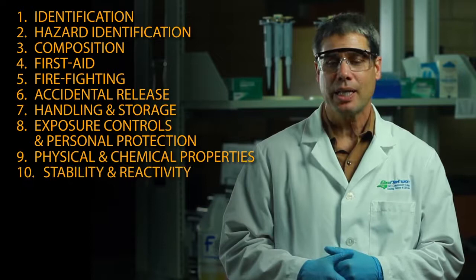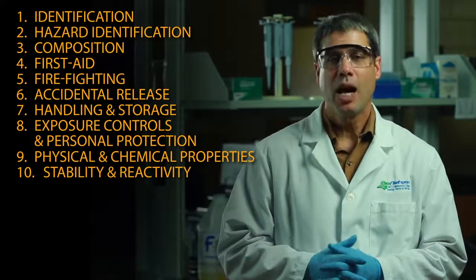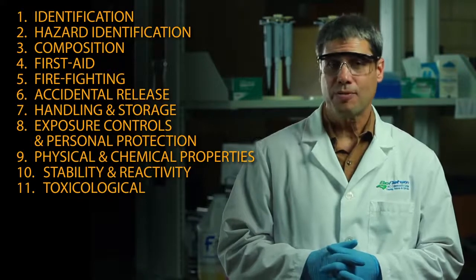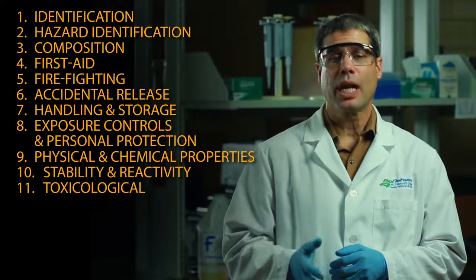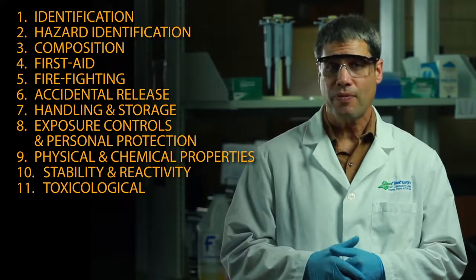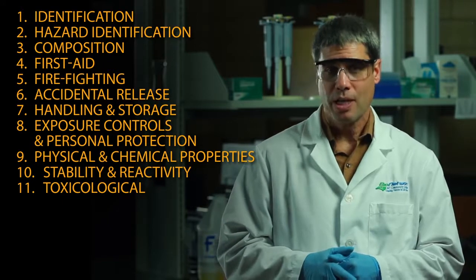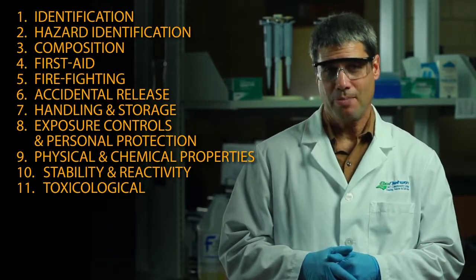Section 10, Stability and reactivity, how to avoid hazardous reactions. Section 11, Toxicological information. Find out about the likely routes of exposure, symptoms, as well as short and long-term effects. Sections 12 through 16 aren't mandatory, but you should at least be familiar with them.